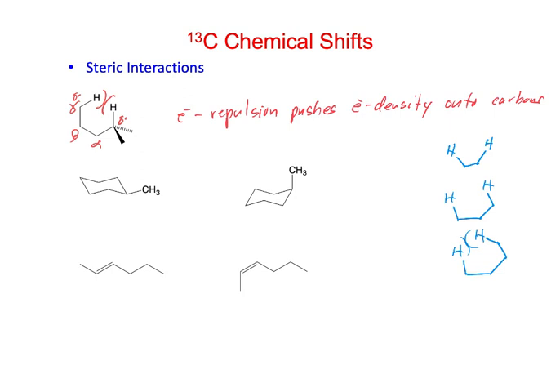But some examples of how the chemical shifts can change depending upon whether those groups are pushed together or not. So this first example with the cyclohexanes with a methyl group equatorial or axial, if this was only the molecule methyl cyclohexane, then this would be in equilibrium, and most of the compound would have that methyl group equatorial, right? But we might have some molecule that has other constraints and holds a methyl group axial versus equatorial, right? So that's probably more important in a situation like that.